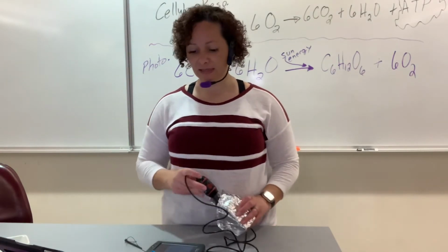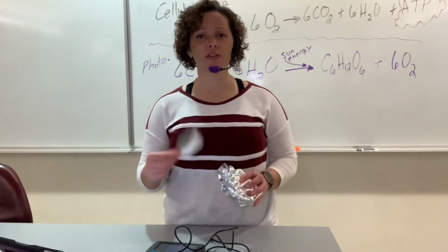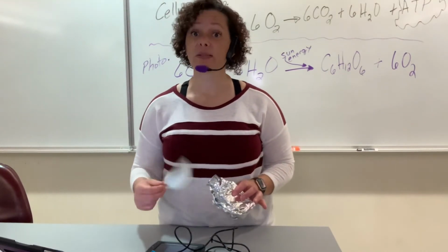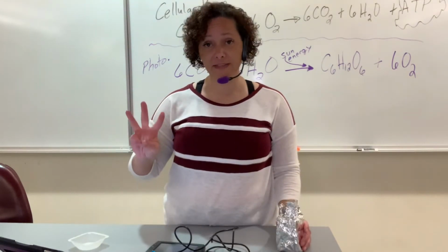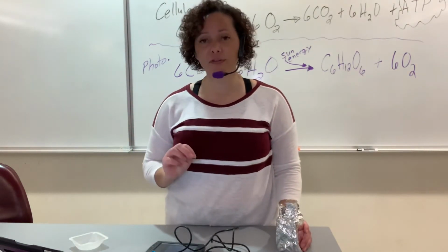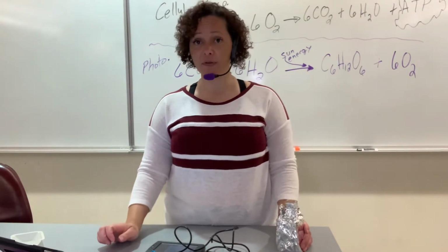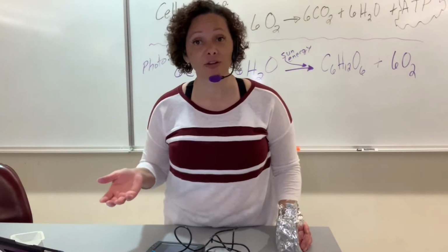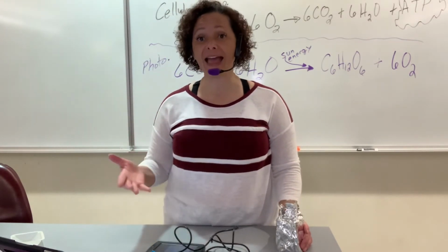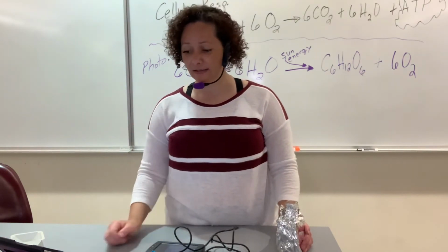Then, while it's sitting and waiting, and you're doing your writing, your group members are giving your organism some oxygen, especially if they're animals, okay? And then you do it a third time, okay? After the third time, you can go ahead and take the average of those 3. You might find that your slope is going negative. Don't worry about it. You're going to figure out the average slope for all 3 trials, and you're going to put that in the last column.